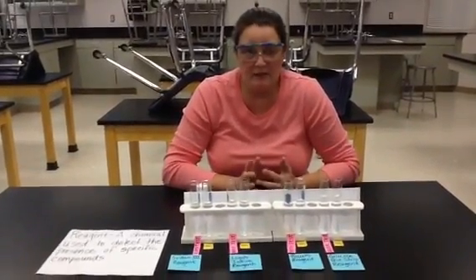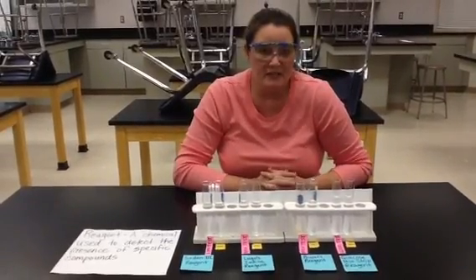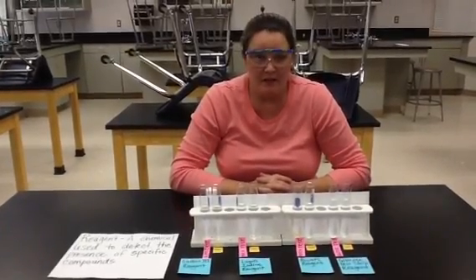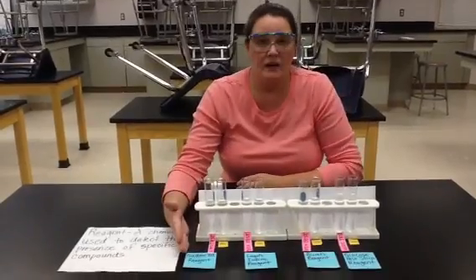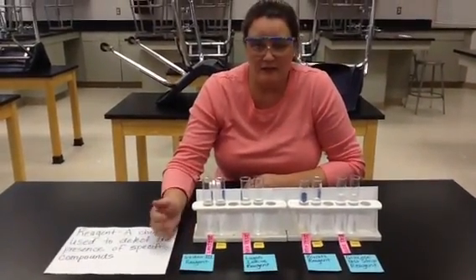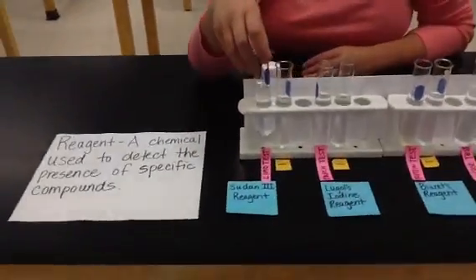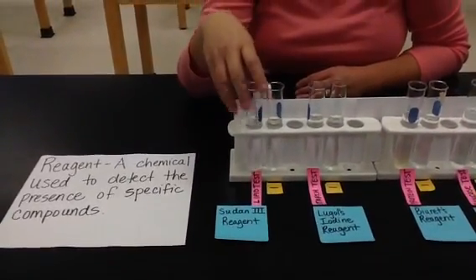So I'm going to run through the demonstration with you, and this is exactly what you hope to see if there is a reaction within a solution, if it has that particular compound. So we're going to start with our lipid test, and on Monday you are going to watch this again with me live, but I want you guys to start looking at it now. So in this lipid test we have one that's got a lipid solution, so it's got some kind of fat, oil in here. I'll just tell you it's in there.